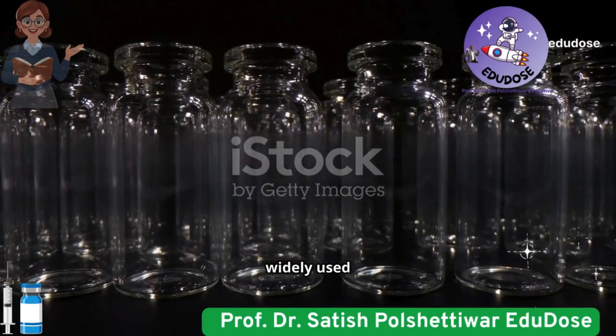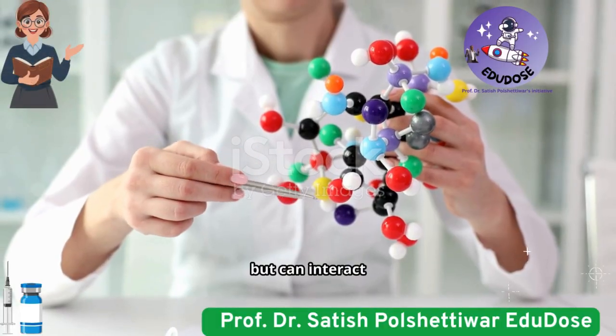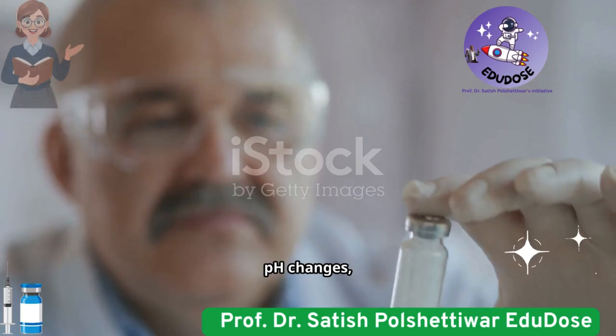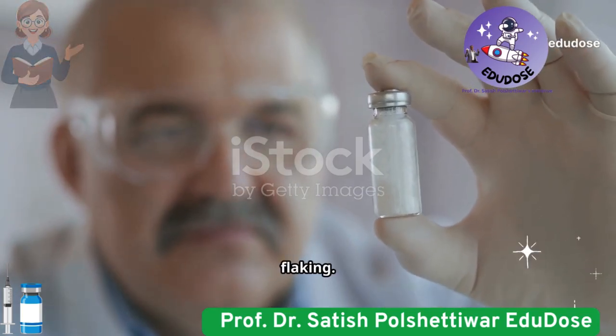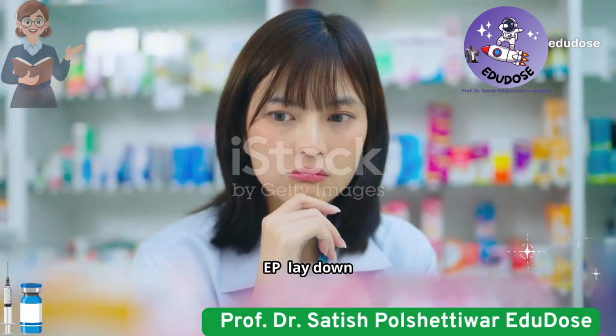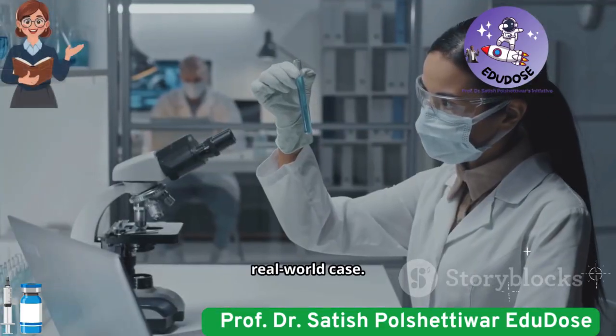Glass is the most widely used packaging material in pharmacy. It looks inert, but can interact with formulations. Problems: alkali leaching, pH changes, turbidity, flaking. So pharmacopoeias, IP, USP, BP, EP, lay down evaluation tests. Let's understand this through a real-world case.